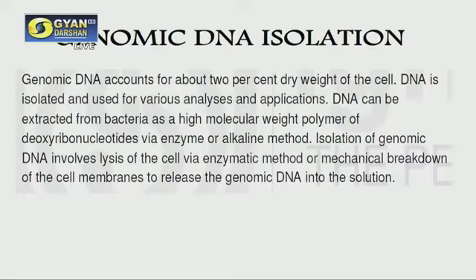So now take a look at what are the topics for these experiments. We will come one by one. The first experiment that you have is the genomic DNA isolation. Now first of all we should know what is meant by genomic DNA and why do you need to isolate genomic DNA?